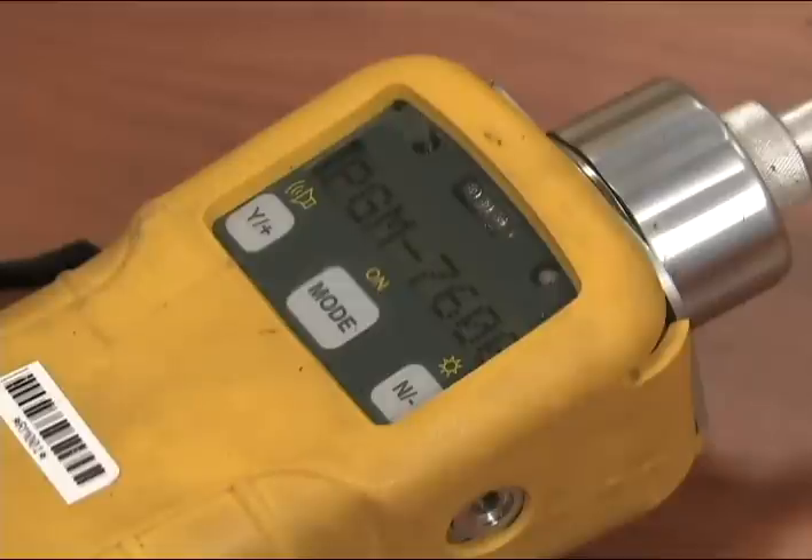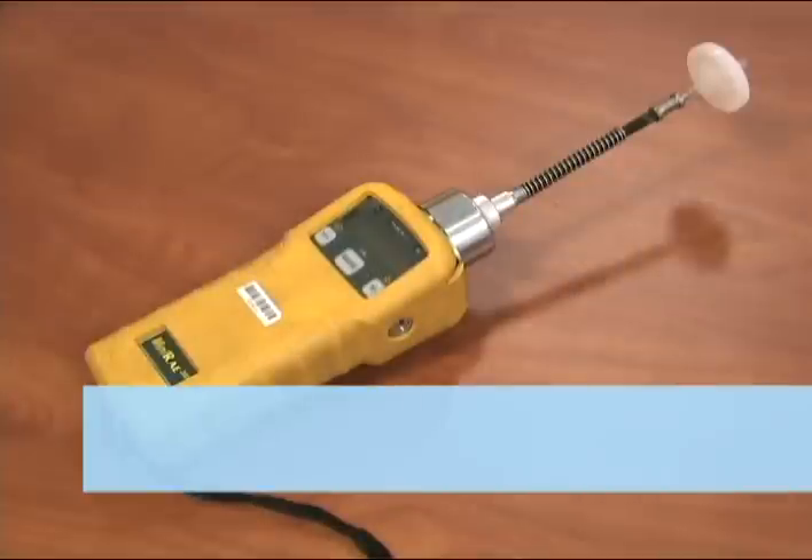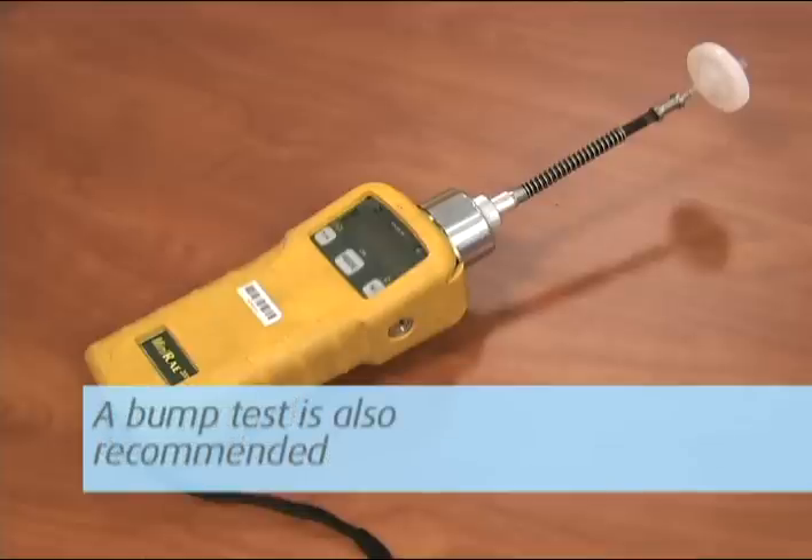Once the unit has gone through the diagnostic phase, it will begin to take readings and data log results. Although Galson Laboratories zeros the unit before it goes out, we recommend that you re-zero the unit before each day of use. If you have a known concentration span gas available, a bump test is also recommended.